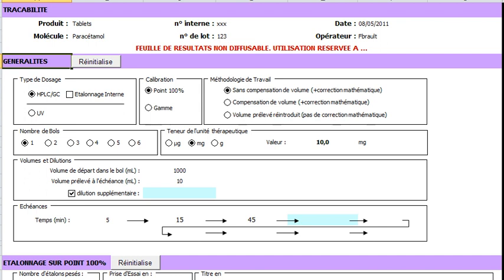This presentation is an introduction about this tool dedicated to the calculation of dissolution results according to the USP or the European Pharmacopeia.